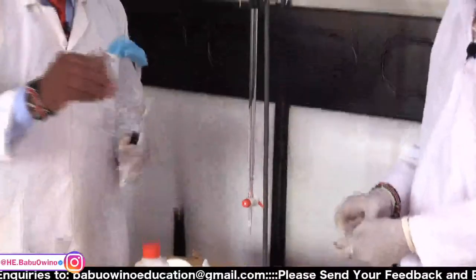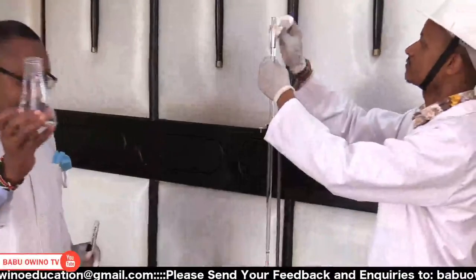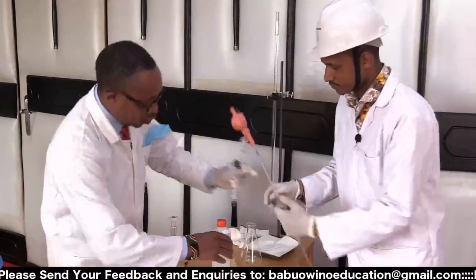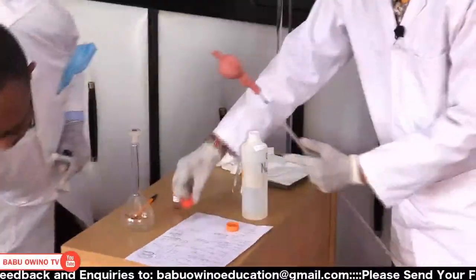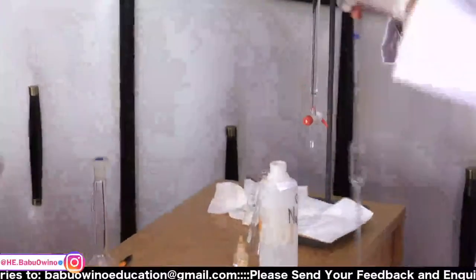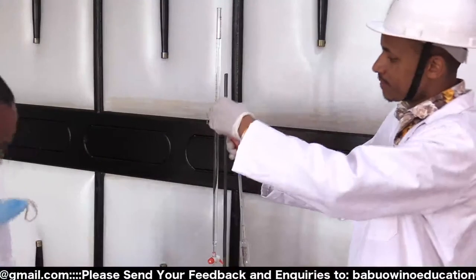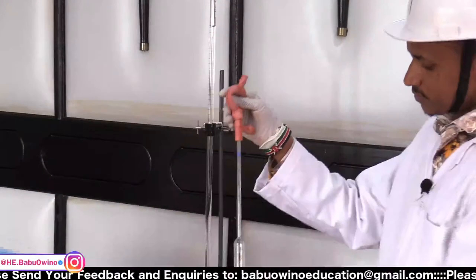Yes, then from there, you ensure that your conical flask has nothing. Then Mheshimiwa will pipette the base, that is sodium carbonate. You open the sodium carbonate. And then the indicator is methyl orange. So from here, kindly release the air. So what we did first is to clean all our apparatus with distilled water. Then after that, just press here on the pipette to release the air, remove the airlock.